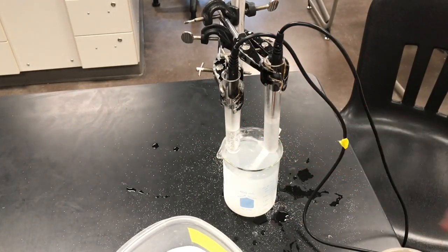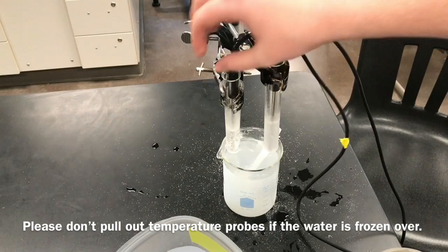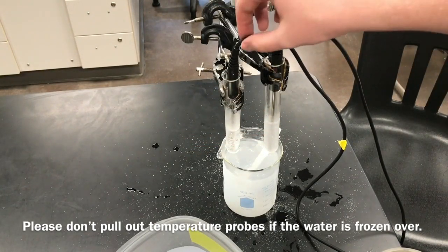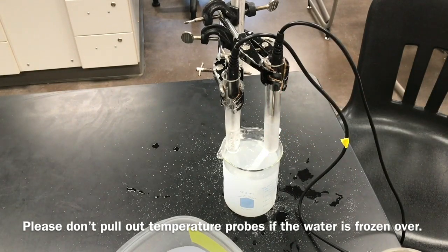There's a very good chance that your test tubes are frozen over, which means, yep, it looks like my freshwater one is completely frozen over. That means you don't want to pull these out, because if you yank it out, you might actually break the temperature probe. So while these are warming up, we can clean off our lab station here.